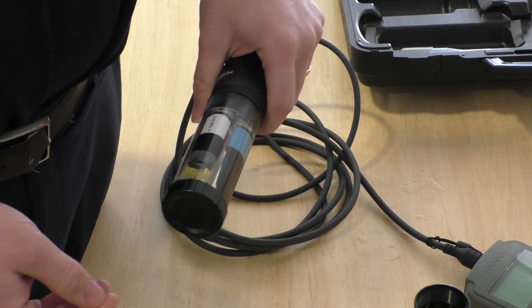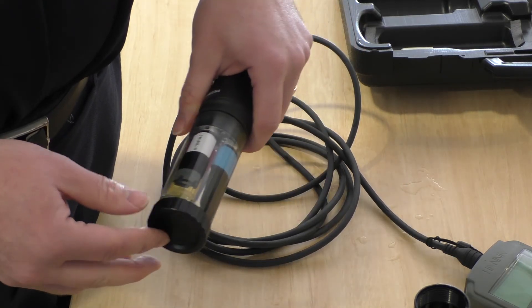The Hanna water quality meters available from Tech Rentals are an easy to use product. Thanks for your time.